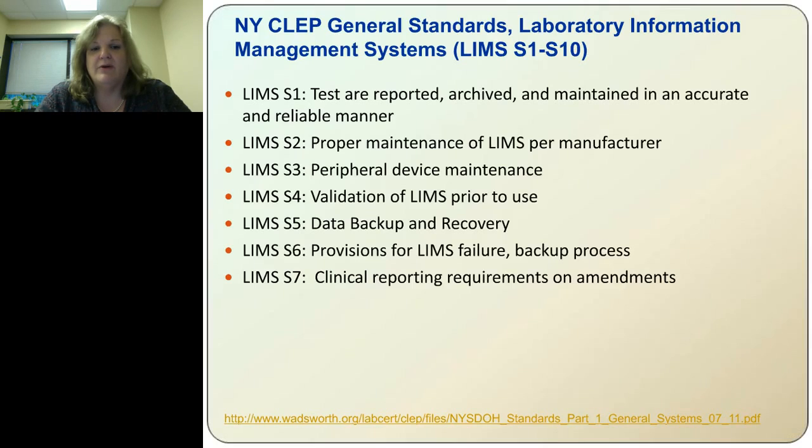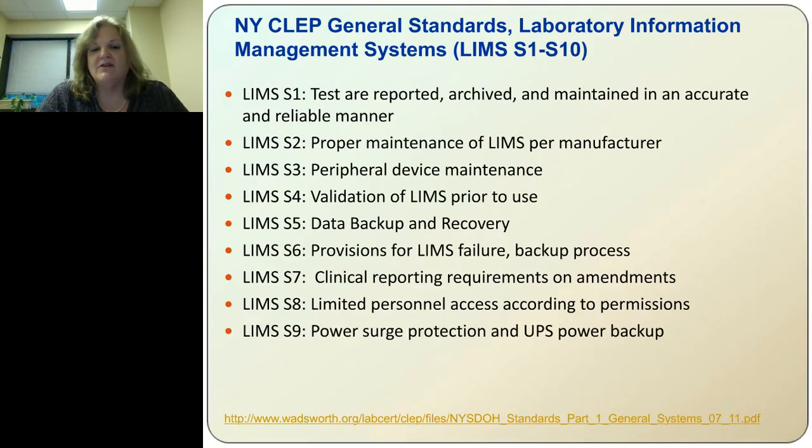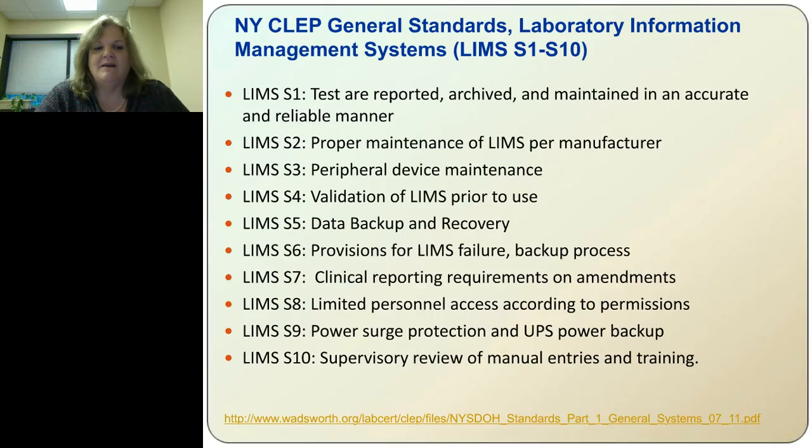You have to have clinical reporting requirements on amendments. Not only does the original report have to come out, but there are certain requirements for amendments that have to be added to the existing report, so they have that as part of their policy. They also have limited personnel access according to permission, so your LIMS has to have a hierarchical permission system under New York State. Also, you have to have power surge protection and UPS power backup, which is perfectly reasonable to expect. And they actually require supervisor review of any manual entries and adequate training for people entering data into the LIMS.